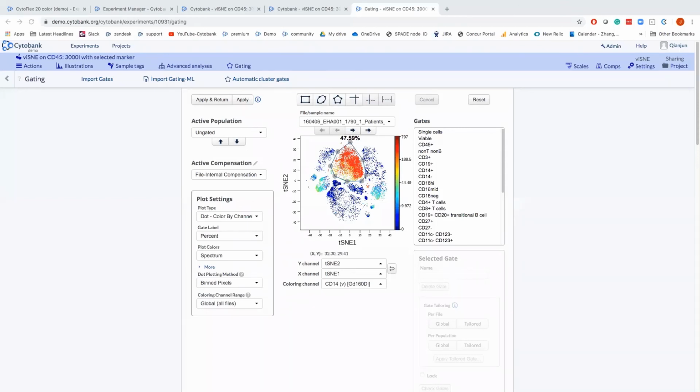If you set theta to 0, the algorithm uses exactly the original viSNE algorithm, which is quite slow because it does the n-pair calculation. If you set theta higher, the modified Barnes-Hut implementation will be much faster.